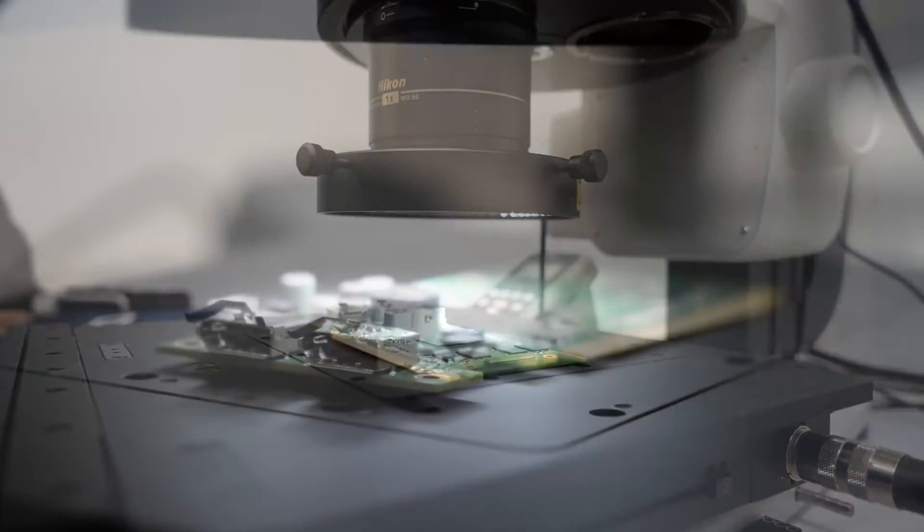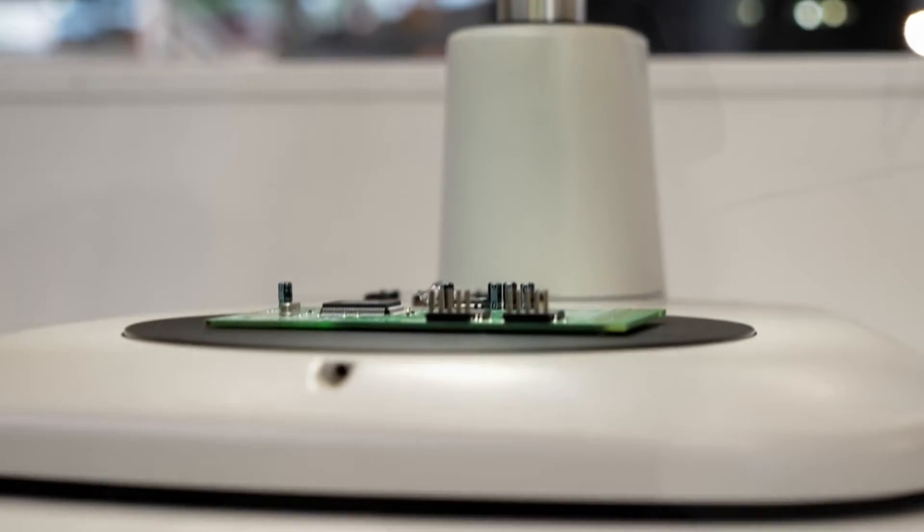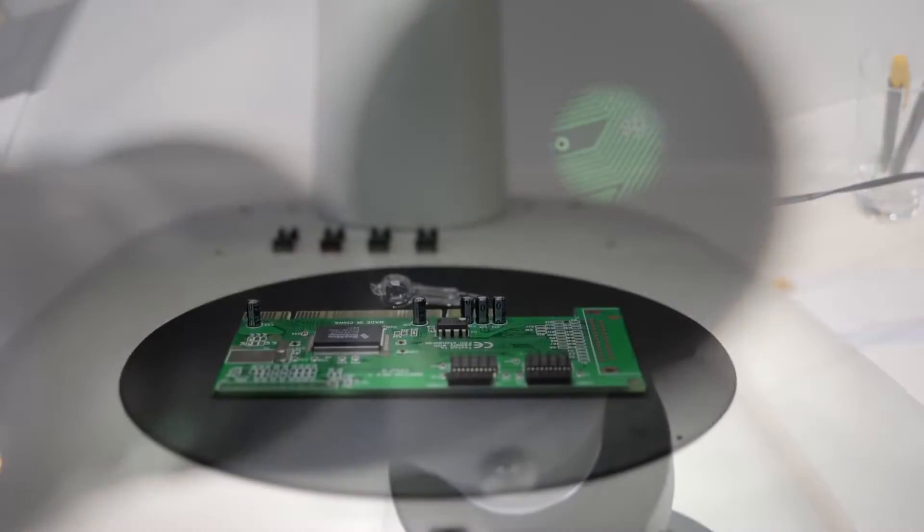We've also got the SMZ25, one of the highest resolution microscopes on the market today. And this is our SMZ745 microscope, which has a very nice easy-to-use trinocular tube — you can do video microscopy very nicely.